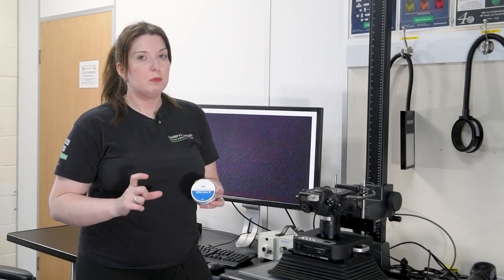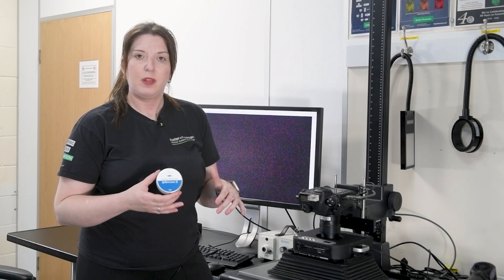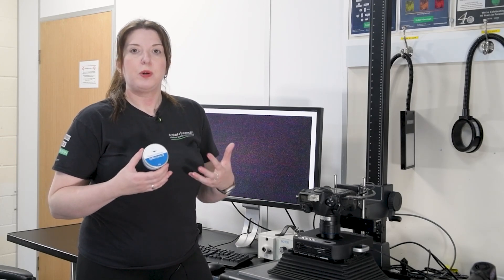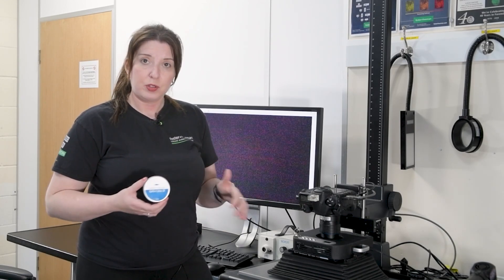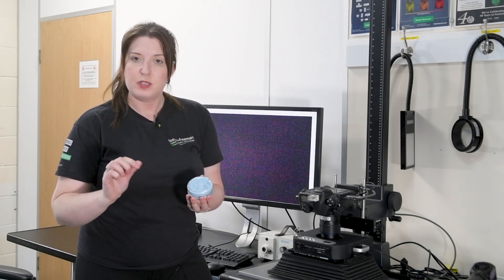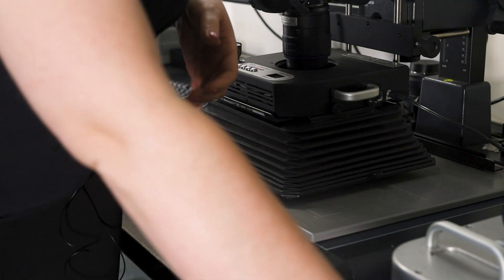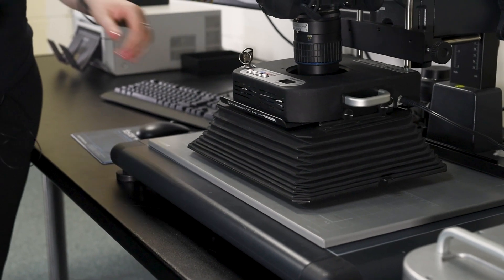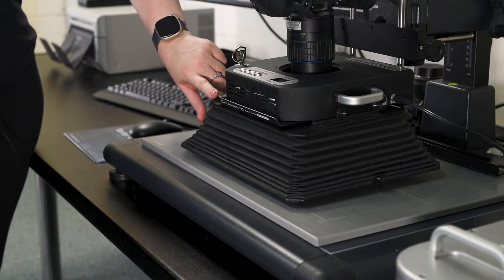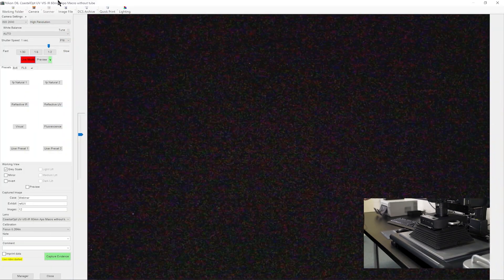FP Natural 2 powder is an infrared fluorescence powder. We're still trying to drop out the background, but we're creating fluorescence inside the infrared part of the spectrum. Because we're creating infrared fluorescence, we can see bright fingerprints while removing the background surface. FP Natural 2 is very simple to use — applied on top of superglue with a Zephyr brush, and you can use a Marabou-style brush to remove any excess. We then use the Cramlite 8x4 light source with a special sharp-cut filter provided for FP Natural 2.